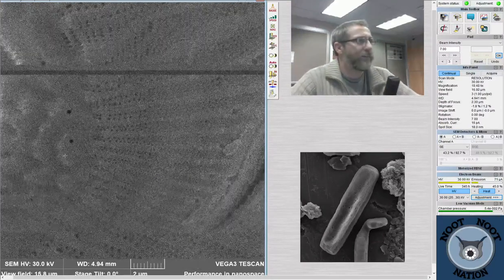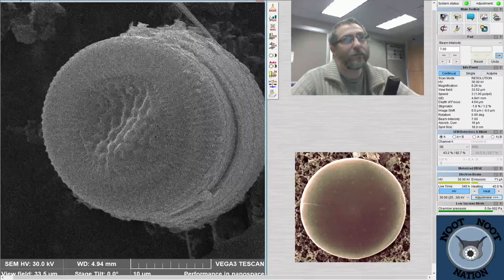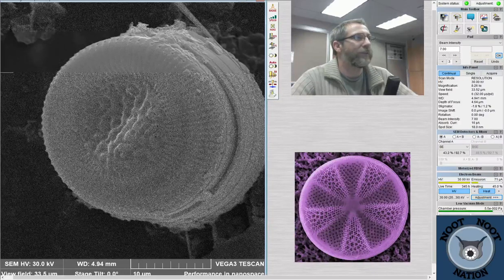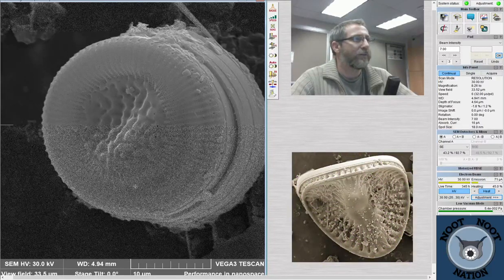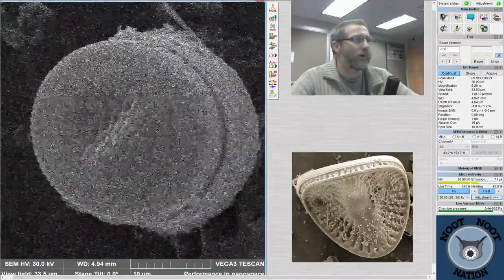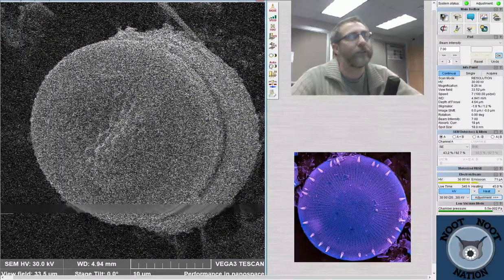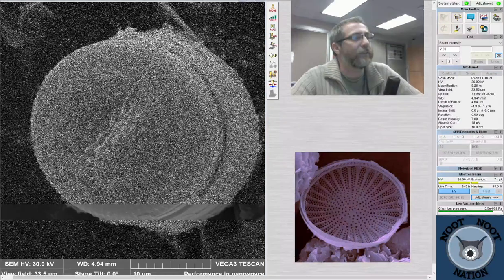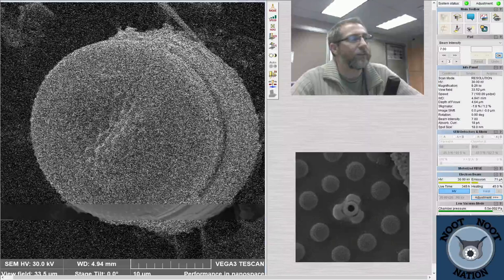Feeling better about it now. This is, I think, Cyclotella striata. There's probably something that does a little bit better in these embayment areas than it would out in the open ocean. I don't think it's quite coming from the freshwater system, because they like brackish water. But because you're in the bay, you get this mix of fresh and salty water quite frequently. And I think that's part of the reason why we see these things occasionally in the samples. There are tidal rivers that get a pulse of salinity going in and out of them daily.